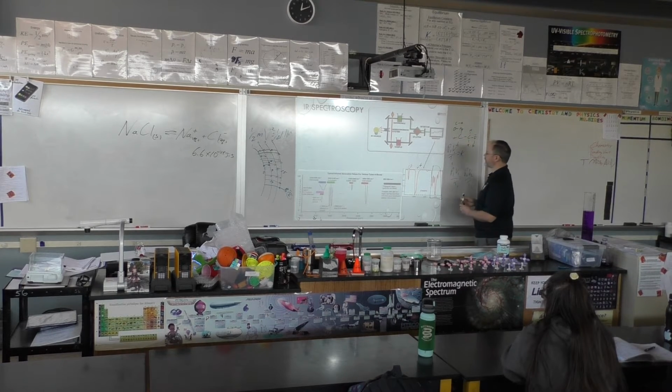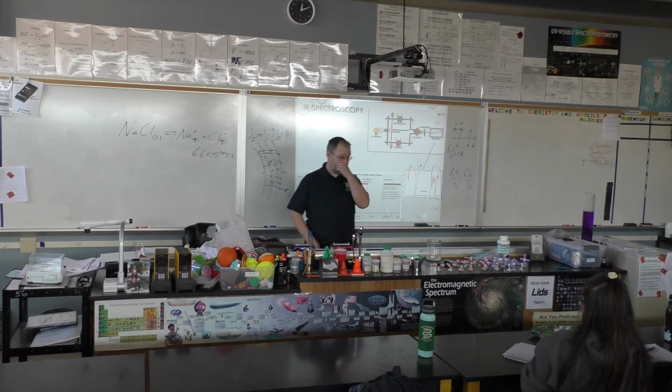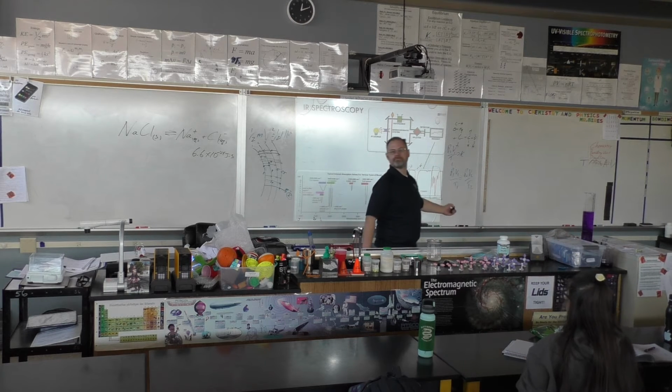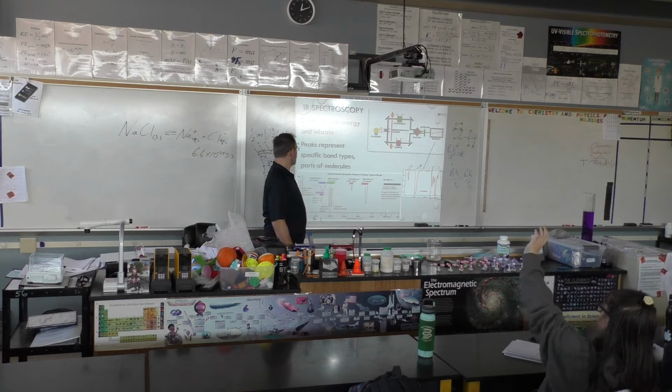So this is the simplest spectrum I could find for you. So that's ethanol. It has a stretch at the OH bond, it has a stretch at the CH bond, so it's ethanol. That's infrared. Anything left? Do we have anything left? That's it. Okay. Any questions?